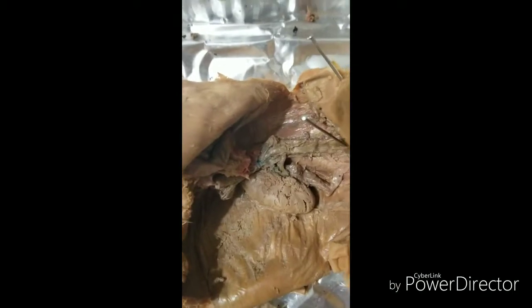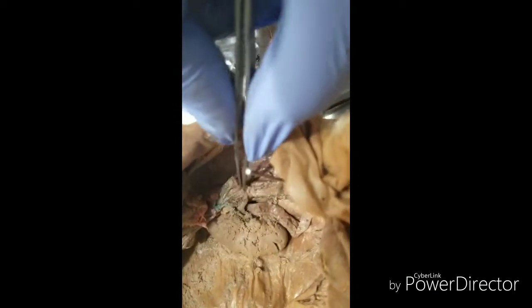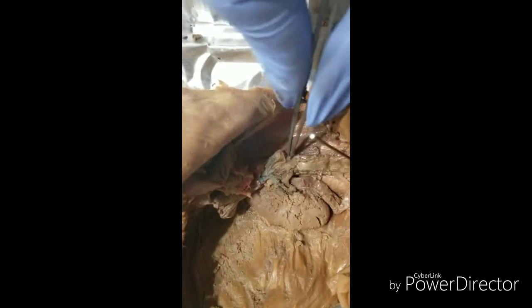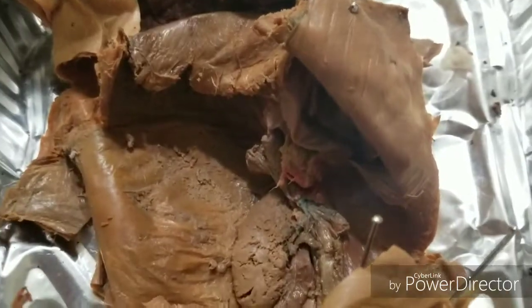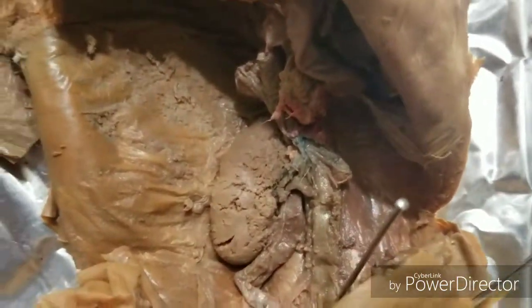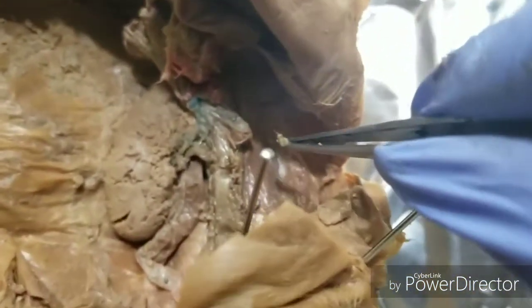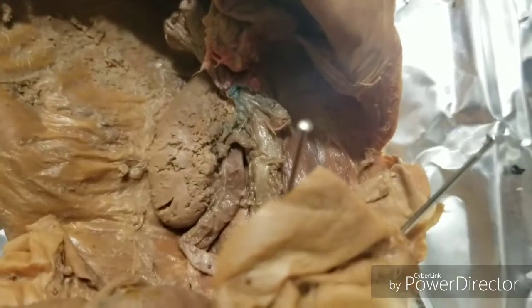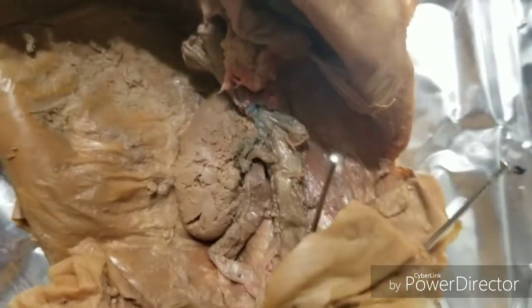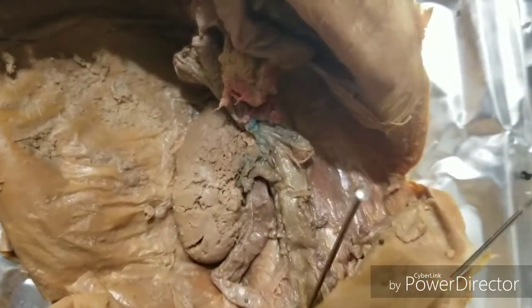Another thing I would like to mention is that when dissecting the pig, there was a lot of fat deposits around. You can still kind of see that there's a lot of fat deposits still around the kidney area. And the reason why we do have these fat deposits is just another form of protection for the kidneys. The fat deposits are just another form of protection, the fat padding for the kidneys, since the kidneys are not completely covered by the ribs.